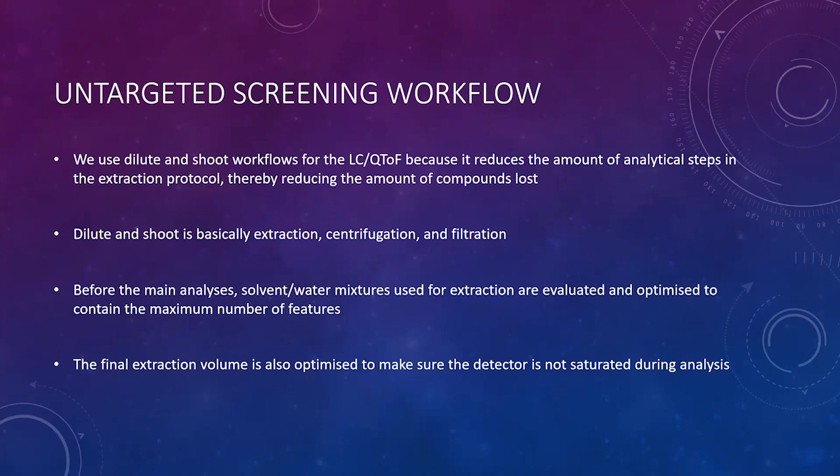Saturating the detector is a very bad thing because you can't trust the analysis in any mass spec once you've saturated the detector, especially QTOF. So you have to make sure that your extract is not too concentrated for the instrument that you're working on.